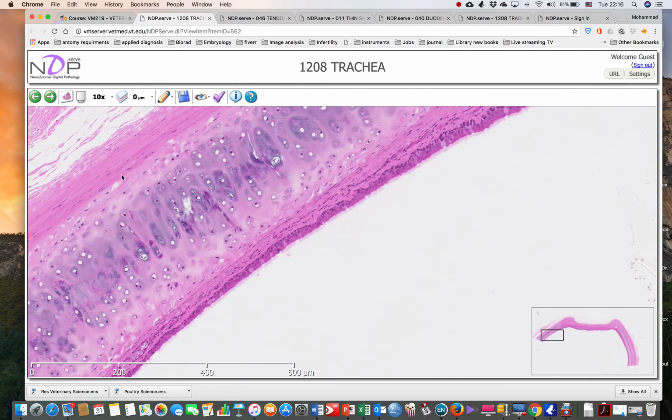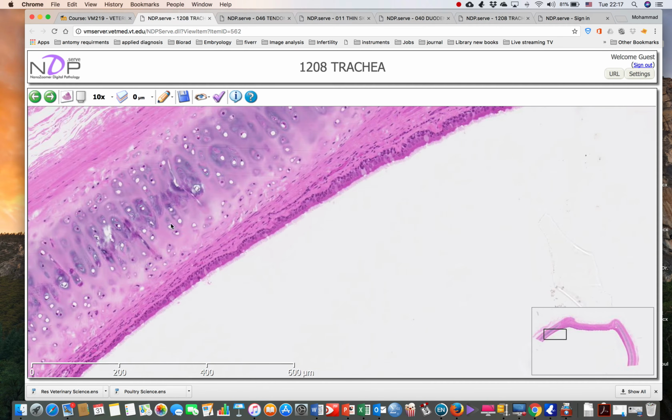and the area here, the area of the perichondrium, the cells, chondrocyte, and the cells that form the inner cellular layer of the perichondrium are called the chondrogenic cells. As we said, these chondrogenic cells will be transformed into chondroblast once these cells synthesize the matrix and the fiber and get surrounded by the matrix and fiber. This cell is called chondrocyte.